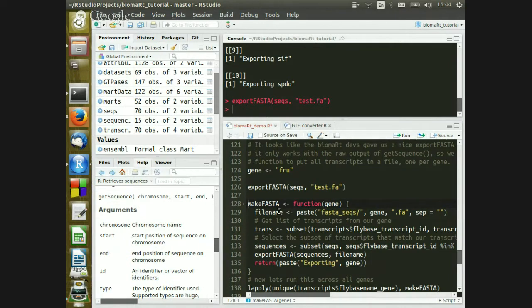Someone was asking if you could effectively use dplyr instead of match, with its difficult match logic. Evidently, left join, as he was saying, works pretty well.